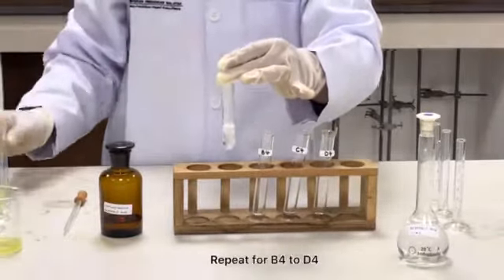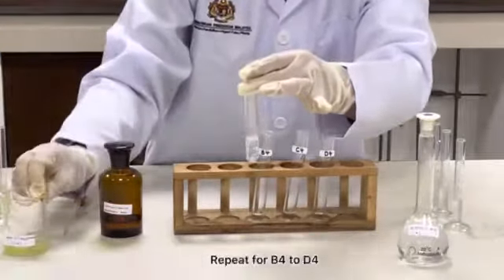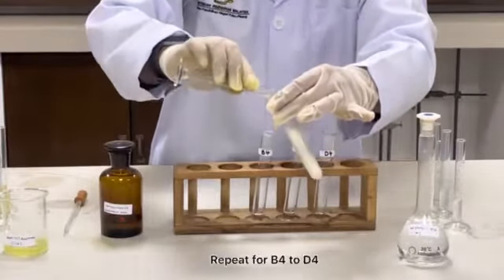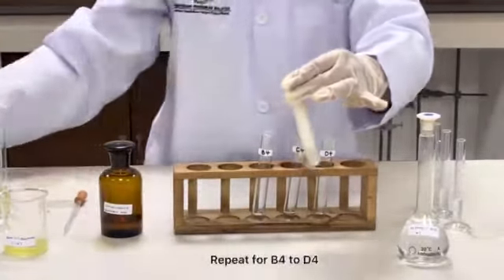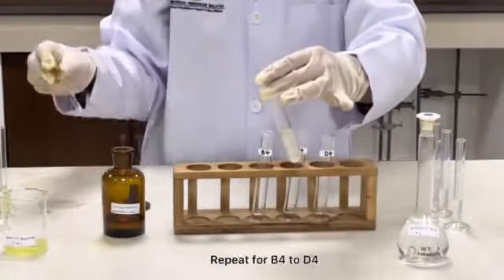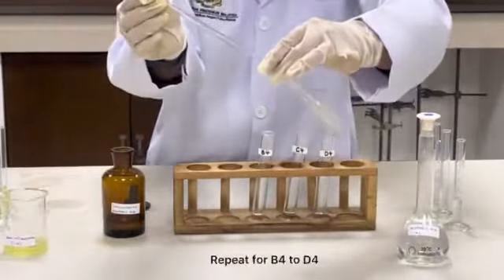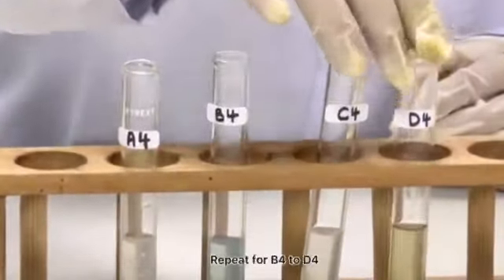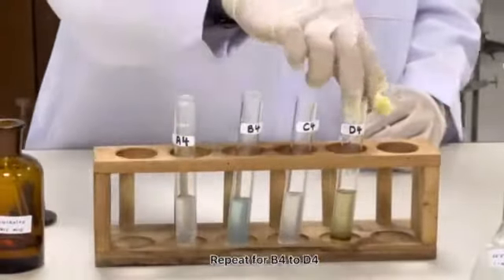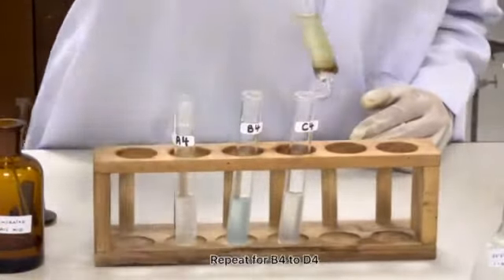Then we add 2 cm³ of 1 mole dm³ iron(II) sulfate and pour it in. Then we drop concentrated sulfuric acid drop by drop. For the nitrate test result, salt A, salt B, and salt C show no brown ring, and for salt D you can see the brown ring over there. Thank you very much.